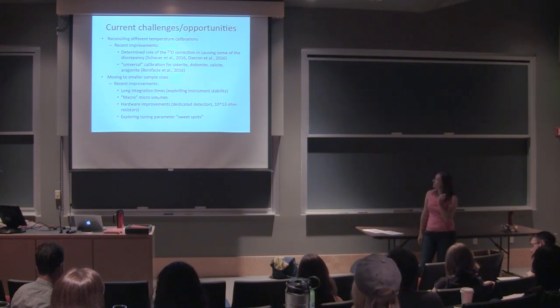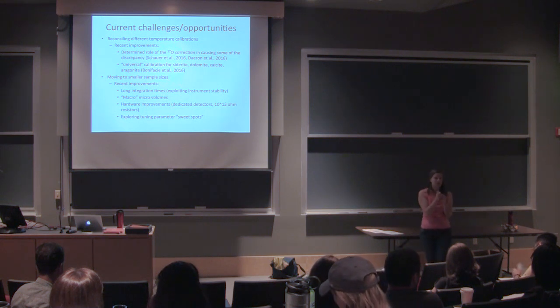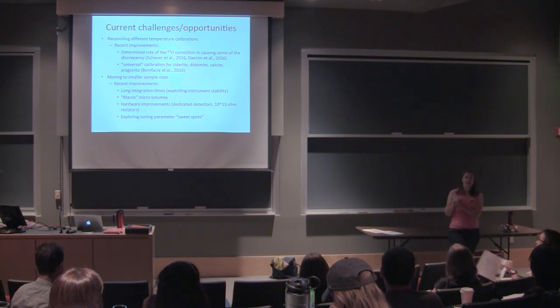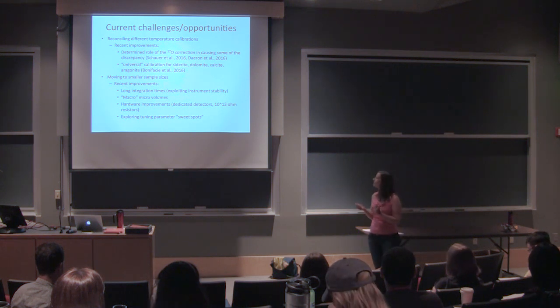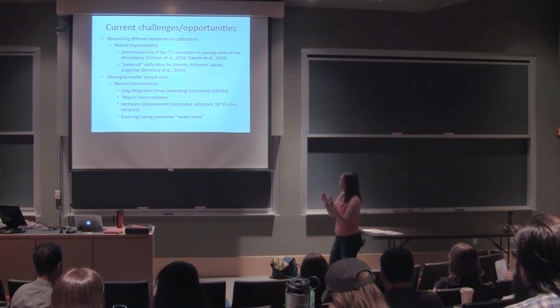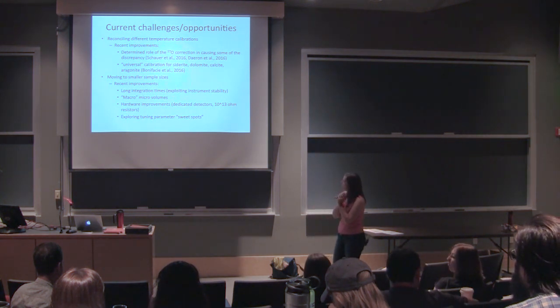Those of you who have done work with forams, typically you're looking at some kind of micro volume. You've bypassed the bellows completely. So there are people who are playing with similar ideas of macro micro volumes. So something bigger than the standard cold finger that you would use, say, to get that single foraminifera analysis, but something a little bit bigger that's still smaller and playing with getting really precise volume match and kind of letting them bleed out at the same rate and trying to get smaller samples that way.